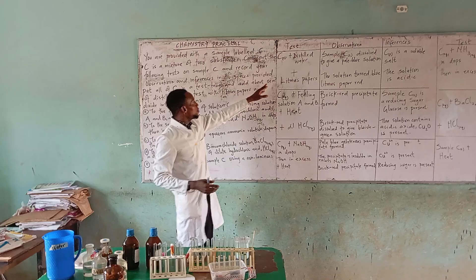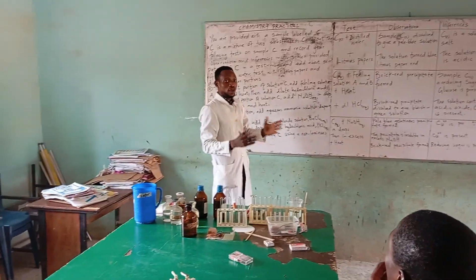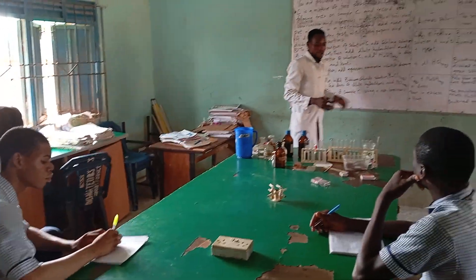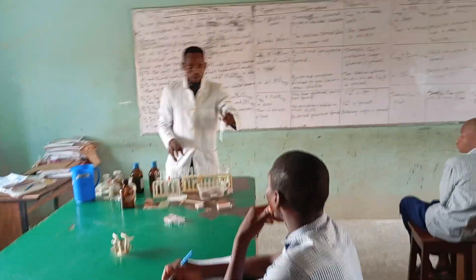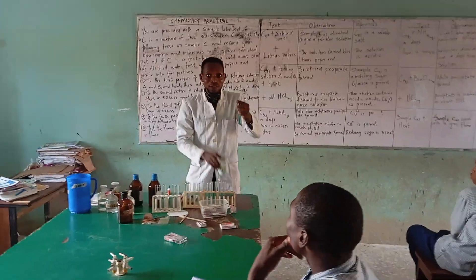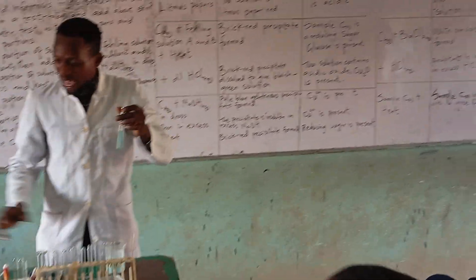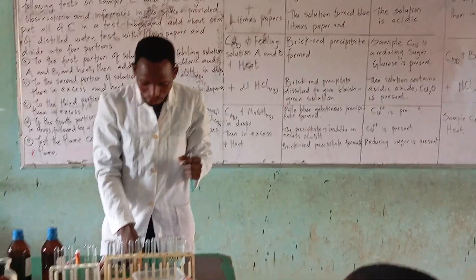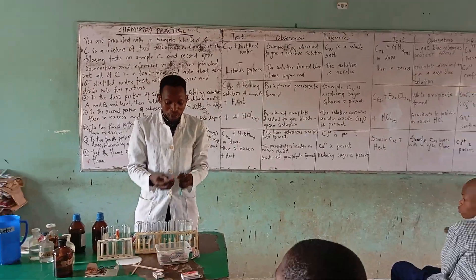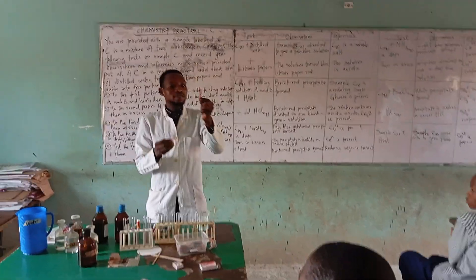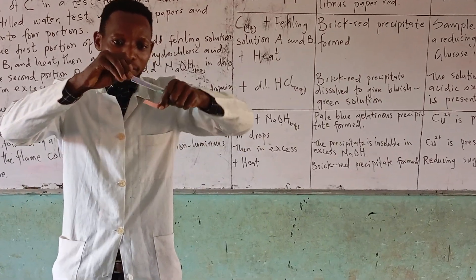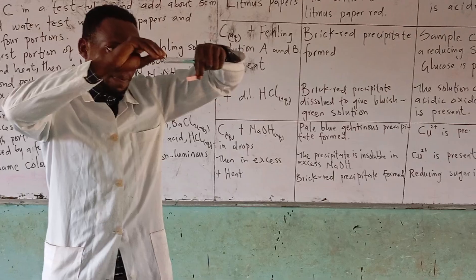Sometimes the amount of water might not be 5 cm³ — it might be 10 or 20 cm³. When you have the considerable amount of distilled water, test with litmus paper. We have put our sample C inside the test tube and gathered our distilled water. These are our red litmus paper and blue litmus paper. Let's test with our blue litmus paper.